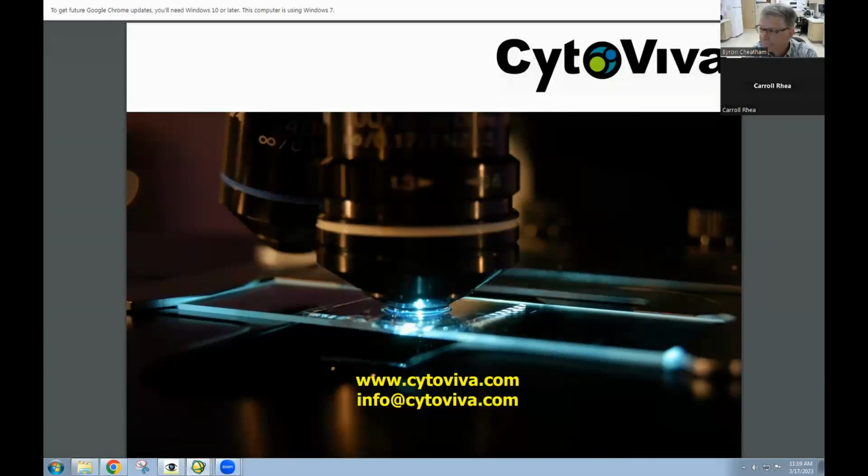All righty, thank you. Two more to go. What type of slides do you use? Is it possible to confuse nanoparticles with particles in dirty slides? Absolutely, it's possible. Dust particles and nanoparticles, especially polymer nanoparticles, both look white, so which is which?